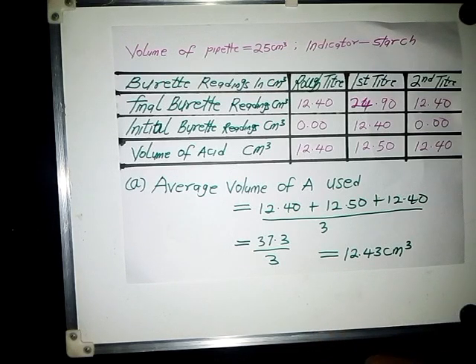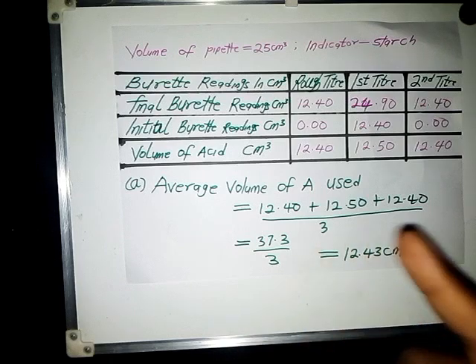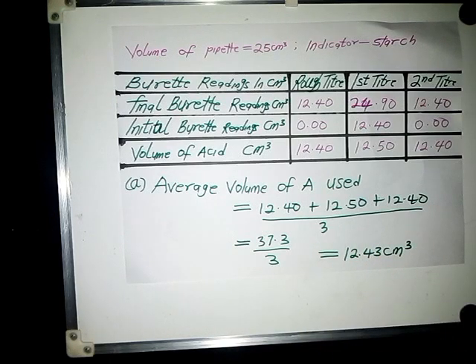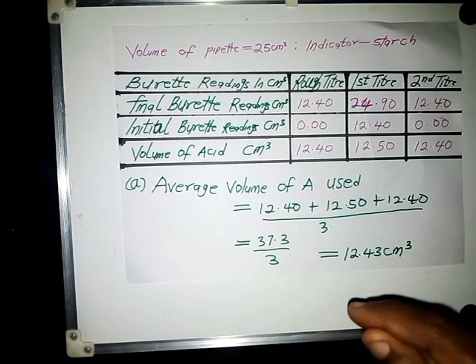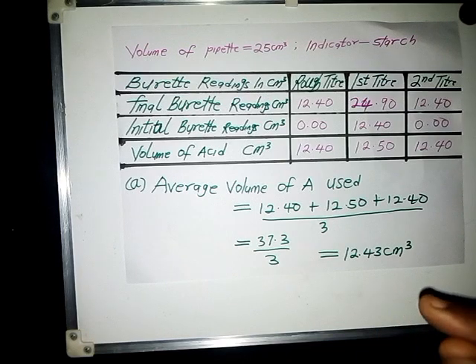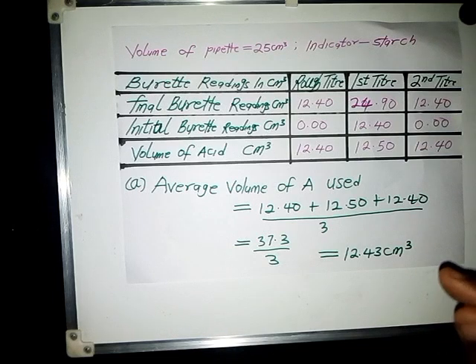Remember, you don't add your starch like you do in a normal acid-base titration. No. This titration is an iodometric titration. It's an example of a redox titration. So you don't put your starch immediately, and there are reasons for that. We'll answer that question at the end of this calculation. You make sure that as you start titrating, you add the thiosulfate from your burette into the conical flask containing your iodine solution, which is golden brown in color. You shake until the solution fades from that golden brown color to pale or light yellow. You stop. You have to be very careful before you add your starch, which turns it to blue black.